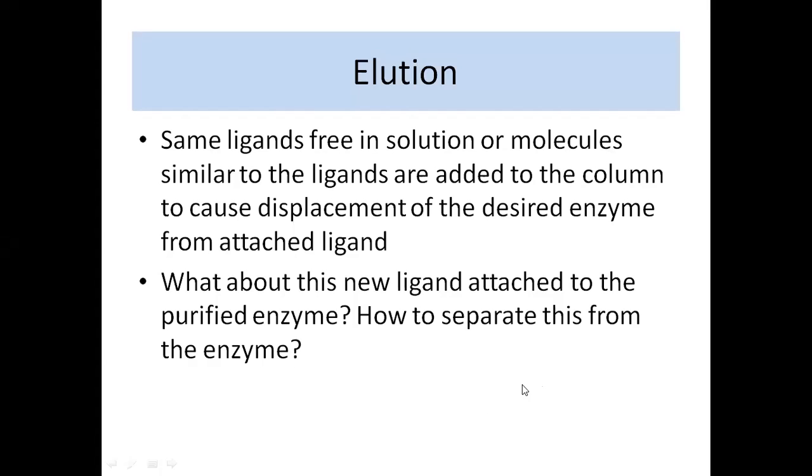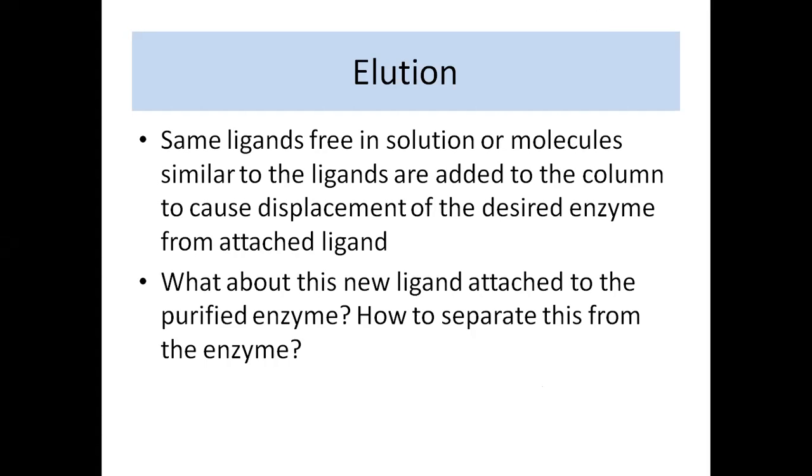So that was about elution. If you can see my slide again, I have already told you in a diagrammatic way how we can separate the desired protein from the column. And then my question to you again is how to separate the complex. And for that, once again, I have the same answer. What is that same answer?